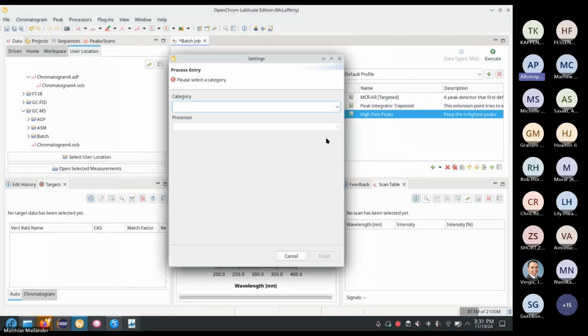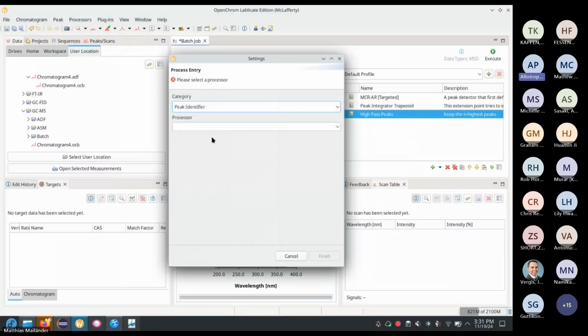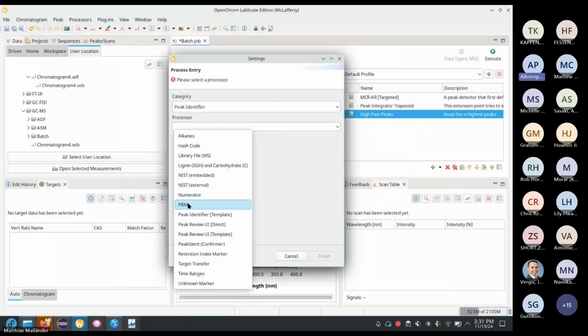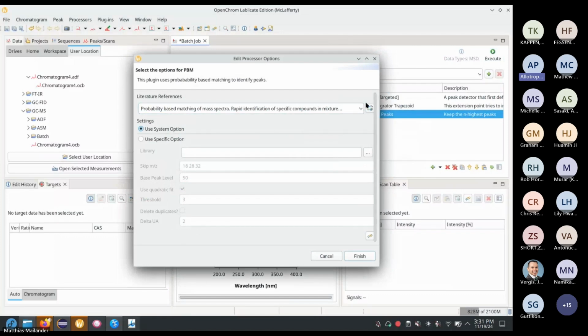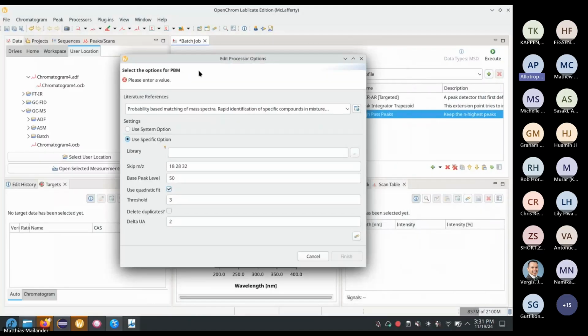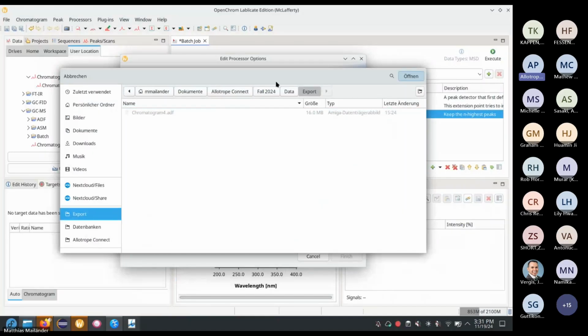And now you're all pretty patient, but I'm an impatient person, so let's do something else now. Let's do PBM, whatever PBM is. And let's also open up that one. I'm looking at ChemStation data right now, so I thought, maybe let's do the original ChemStation identification method that we got working now.